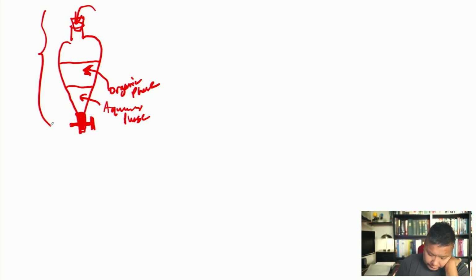And so what you do now, this could be a multiple step process, but what you do now is you can turn this knob so that you open up the pipe, and then you can very slowly drain out the water into a flask sitting below it. That's a terrible looking flask, but that's my flask, okay? There we go. That looks better. That's a flask. And so the aqueous phase goes down here, leaving you behind with just your organic phase that's at the top.